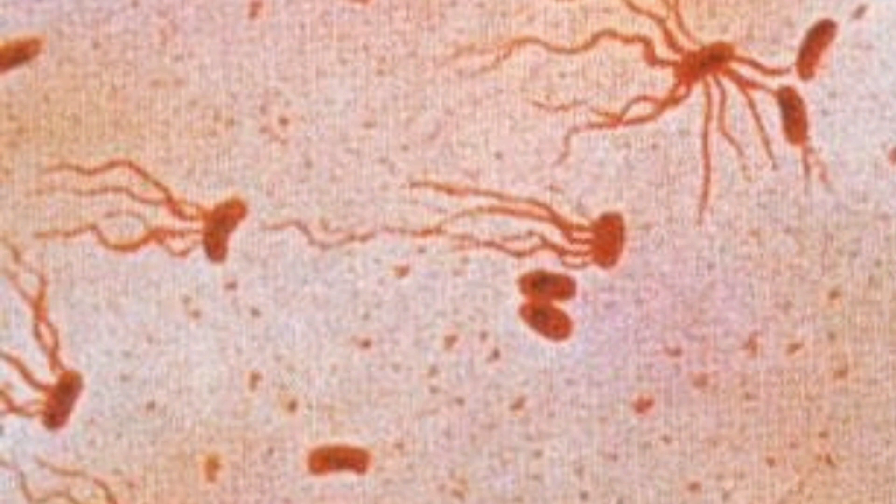From this diagram it is clear that the flagella of a bacteria are being stained, and in staining the flagella we can identify the number of flagella as well as the arrangement of flagella on a bacteria. For this reason we perform flagella staining.